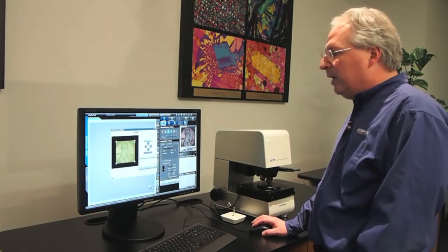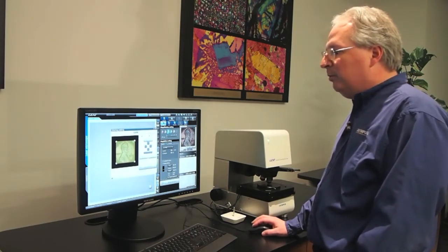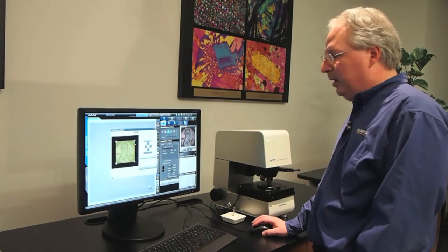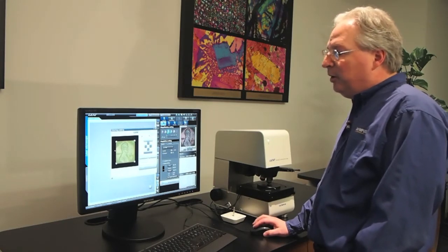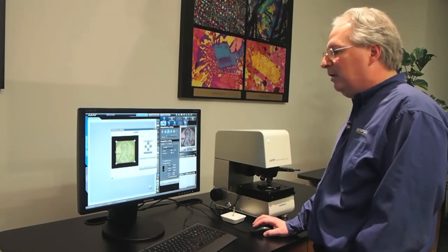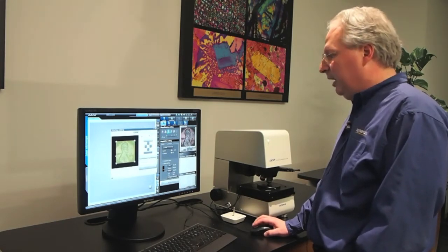But now we're also capturing a lot of frames outside the penny, and there are still areas that we didn't catch in that initial scan.